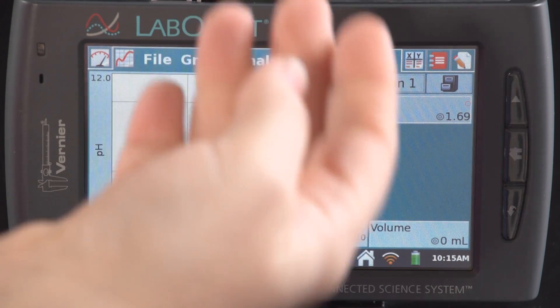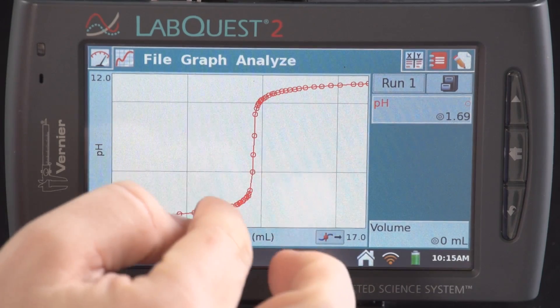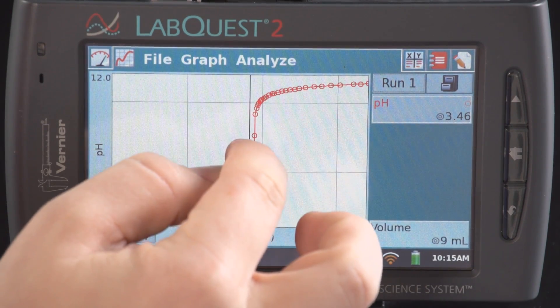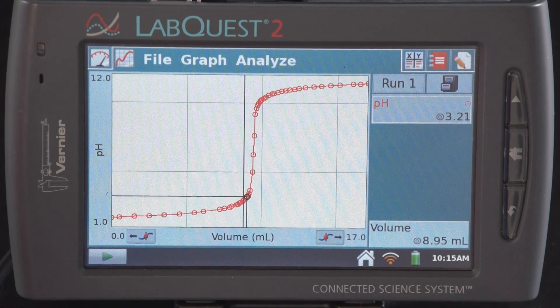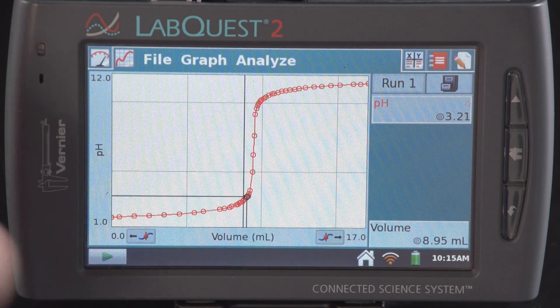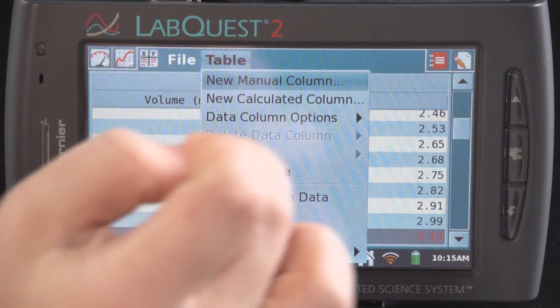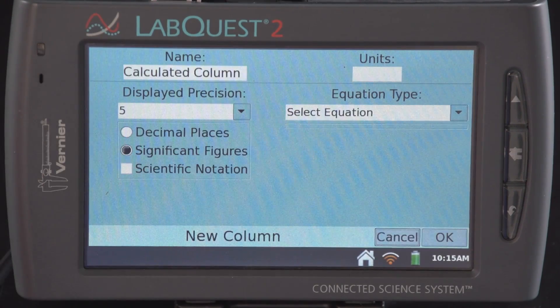Once there is a complete titration curve, we can stop data collection. Then we'll determine the equivalence point by tapping along the graph. I can also calculate the first and second derivatives. To do that, I'm going to go over into the table screen and from the table menu select New Calculated Column.